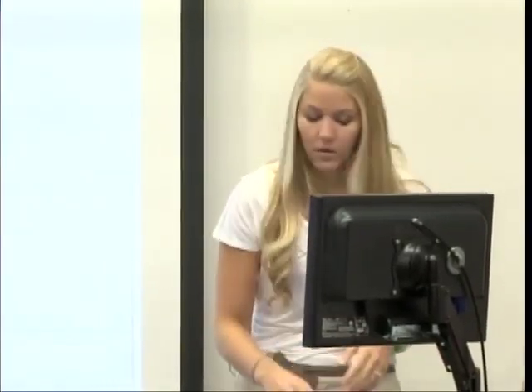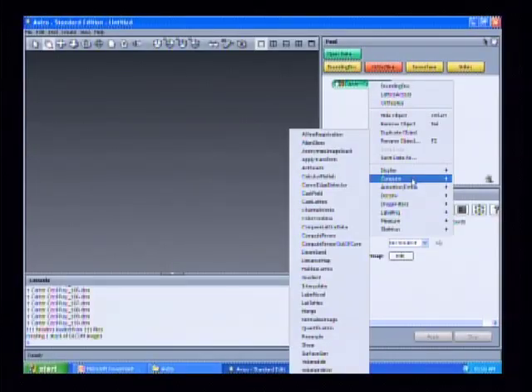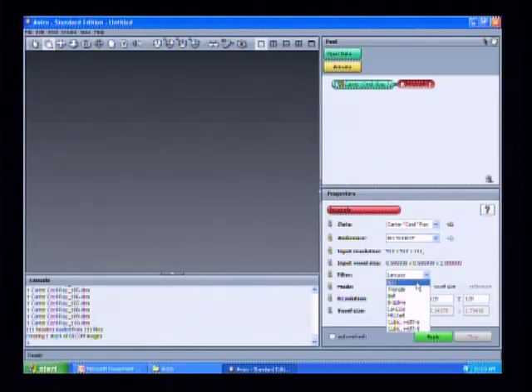So what we're going to do first, before we even open up the data in order to do the segmentation, is we have to resample the data. So if you are to right-click on your data set, you want to go down to where it says Compute. In your instructions, it says in the properties area, you're going to select cubic width 8 from your filter drop-down menu. So in your filter menu, you just scroll down to cubic width 8 and just select that.